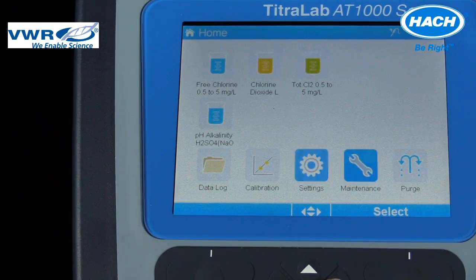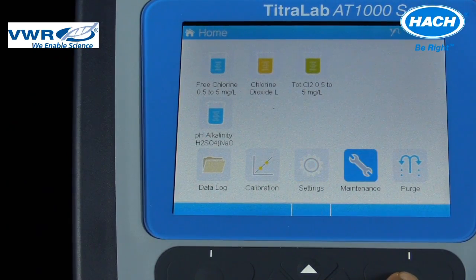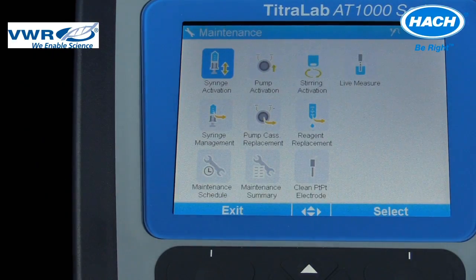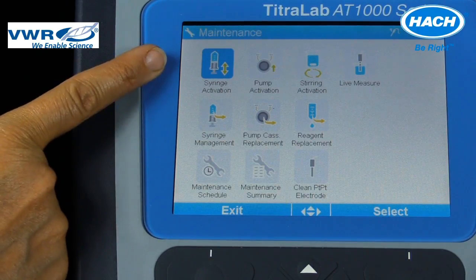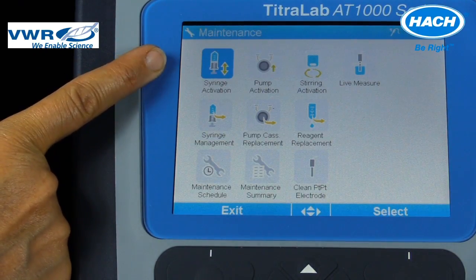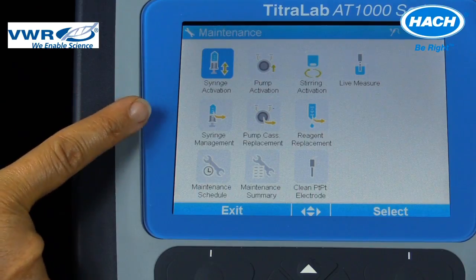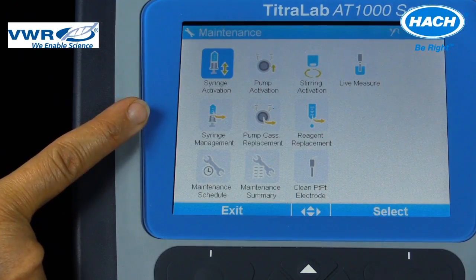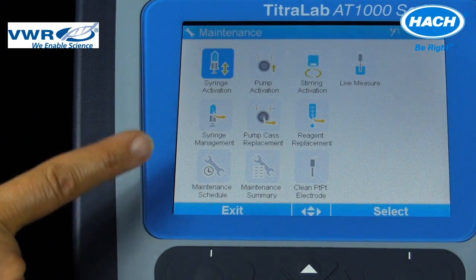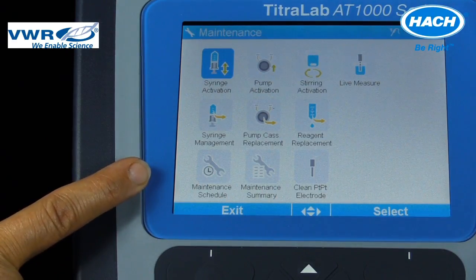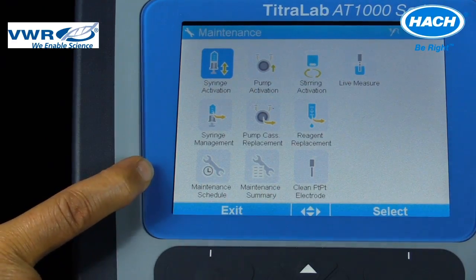The maintenance settings are available to perform diagnostics on the titrator components. For instance, the syringe, pump, and stirrer can be tested. The software can also track maintenance performed on the pump and replacement of reagents, and can alert the user when maintenance is required based on a determined schedule.